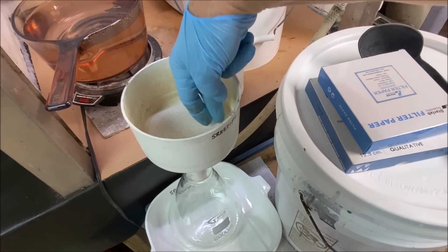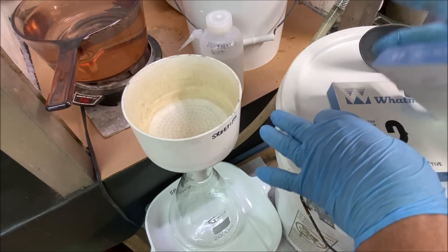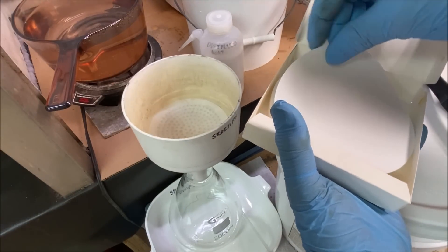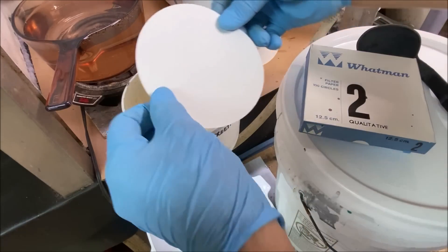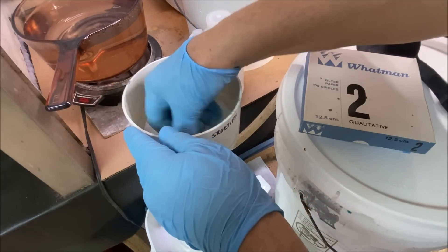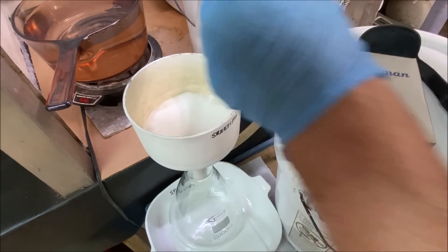I've got this small filter in here to cover up the holes. Then I take a larger 12.5 centimeter filter and fit it down in there, so I've got two filters in the bottom of this funnel.